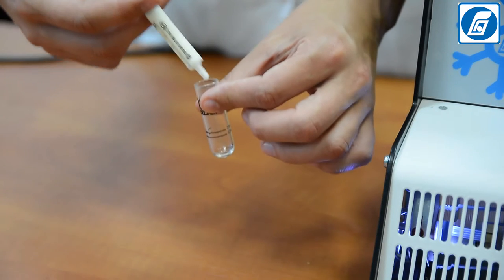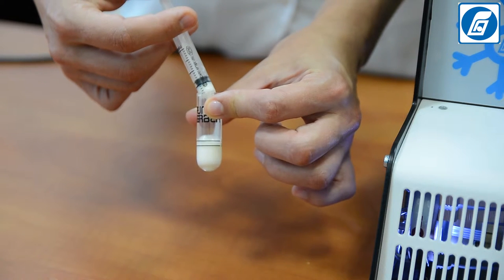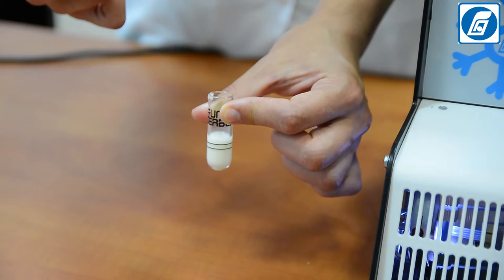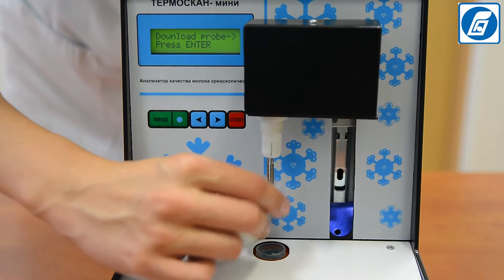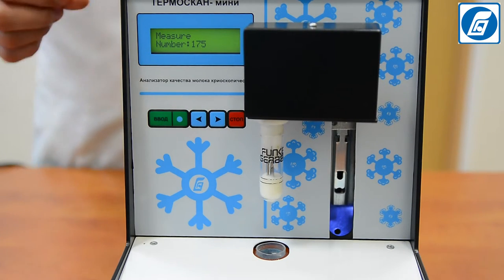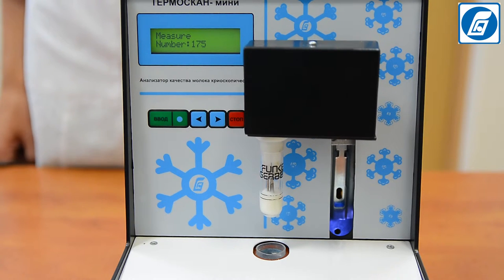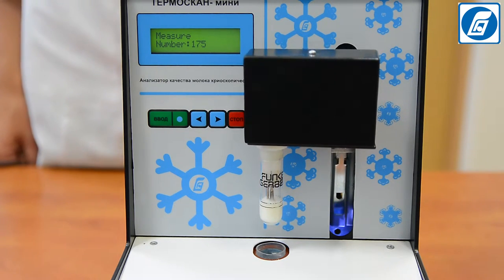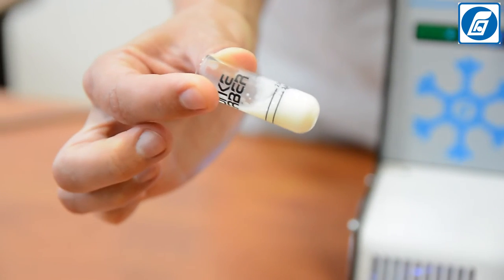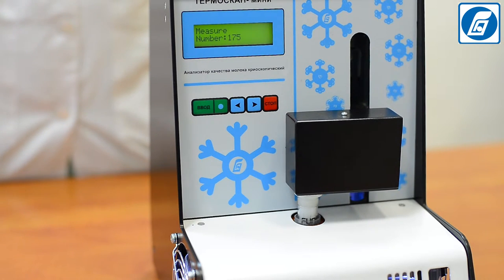Repeat the measurement with another portion of milk. If the difference in parallel measurements exceeds the convergence of ±0.004°C, the results are rejected and two more consecutive measurements are carried out. We do not recommend reusing the same portion of milk, as freezing causes protein denaturation which can yield a lower result.